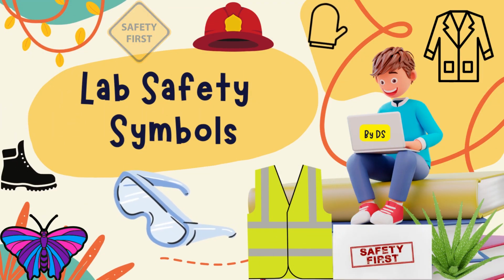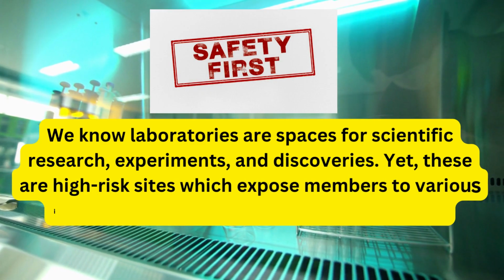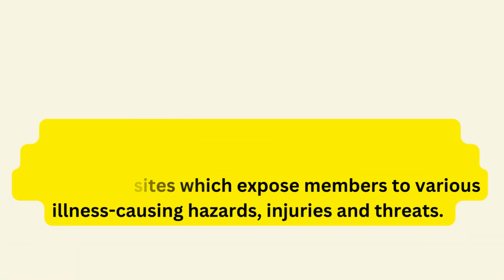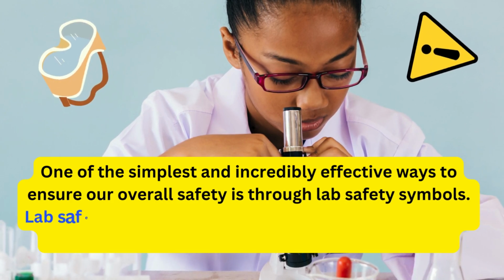Lab safety symbols. We know laboratories are spaces for scientific research, experiments, and discoveries. Yet, these are high-risk sites which expose members to various illness-causing hazards, injuries, and threats. One of the simplest and incredibly effective ways to ensure our overall safety is through lab safety symbols.